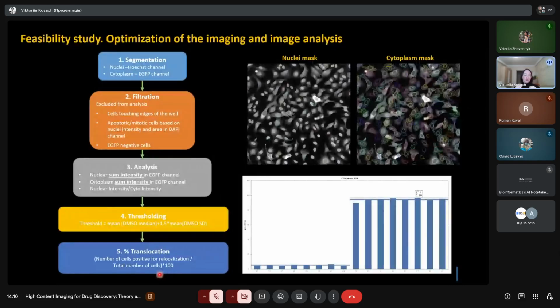So your raw fluorescent units will differ a bit from day to day, maybe between plates. But your effect should be the same. And if you normalize to the percentage of the cells, these small differences between raw numbers from day to day will be eliminated by normalization of the data.